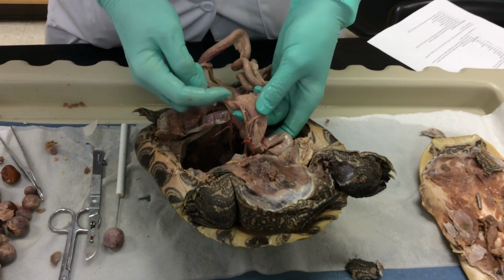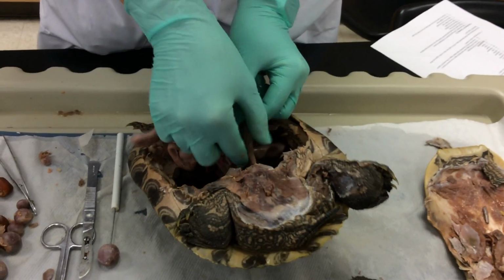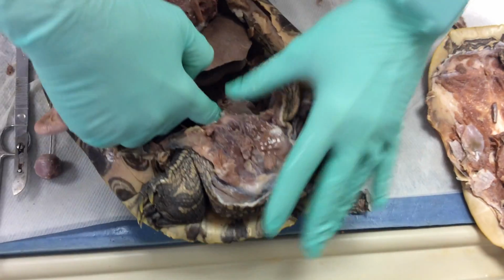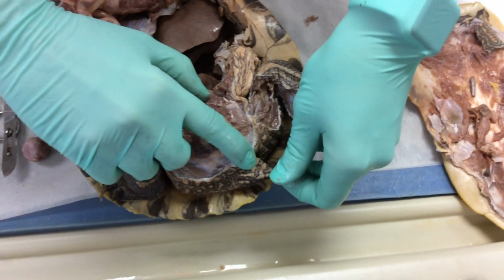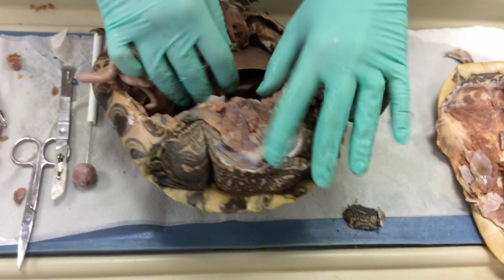And you can see that abrupt change right here from the small intestines to what would be the large intestines, or the colon. So the large intestines go down here and all the way back down to the bottom. Where my finger is down there is where the rectum starts, and the rectum leads from here to this opening, which is known as the cloaca. And this is where gametes as well as waste products will enter or leave the body.